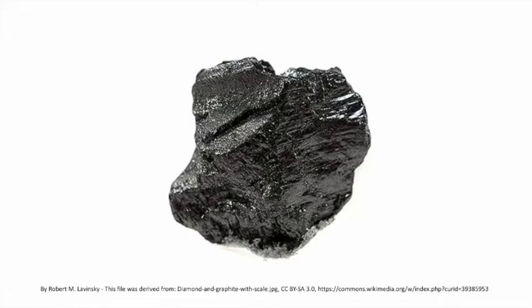Imagine you have a sample of an element like carbon, and you want to know what isotopes are in it, and you want to know what proportion of each isotope is in it. How can you do this? You can use mass spectrometry.